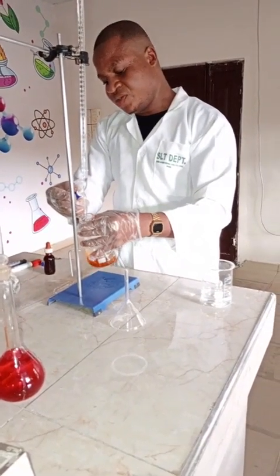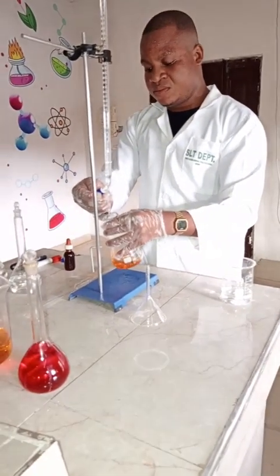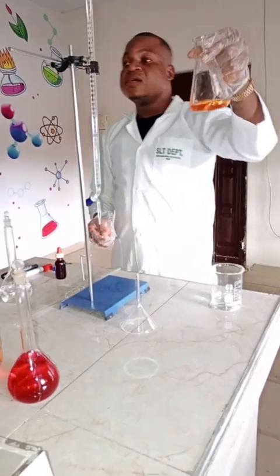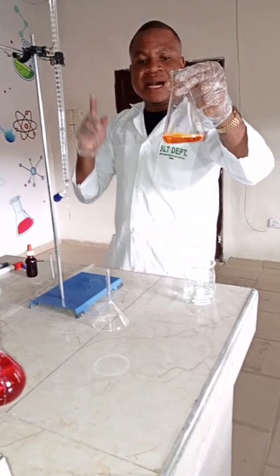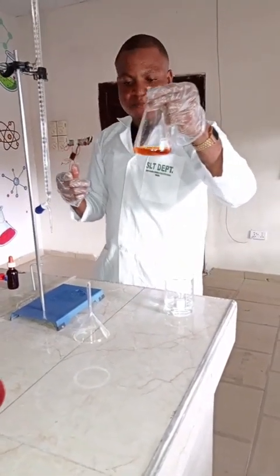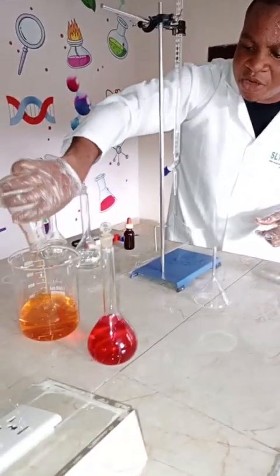Now, if you look here, there is a color change, and this is the endpoint. At every endpoint, you notice a color change. Are you following? Now I'm going to discard this.